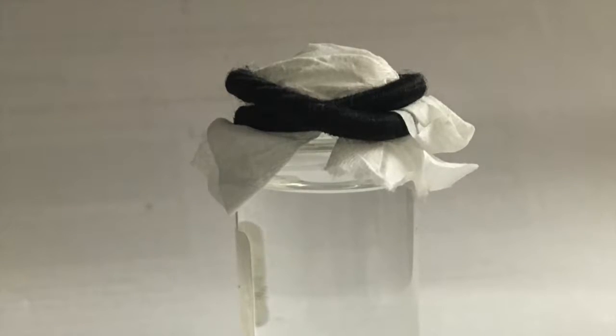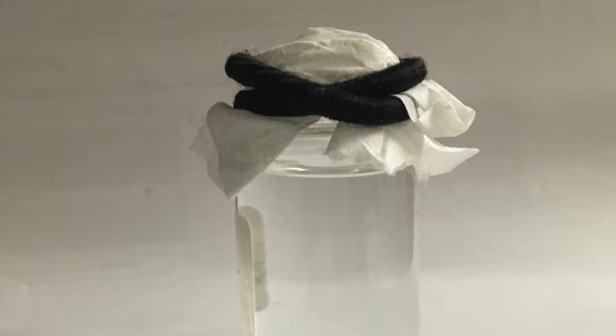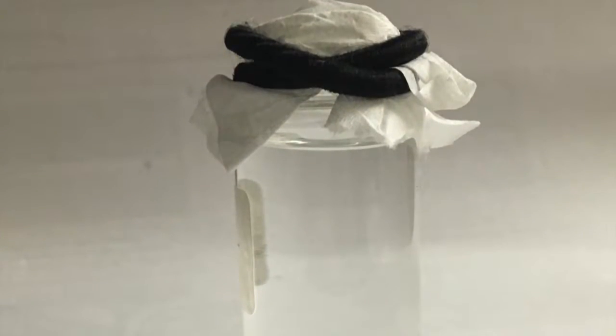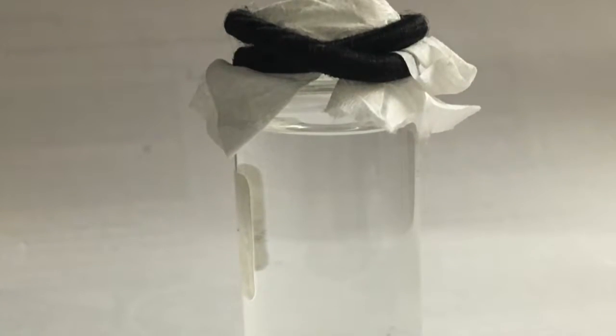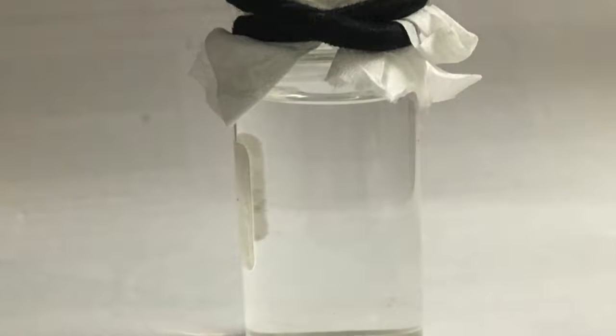Today is Sunday, January 22nd, 3 days after the lab's completion. Upon arriving home on the first day, I positioned the Chem wipe on the top of the vial so that the system could breathe and water could evaporate. After sitting stationary for 3 days, there is no visible crystal growth.